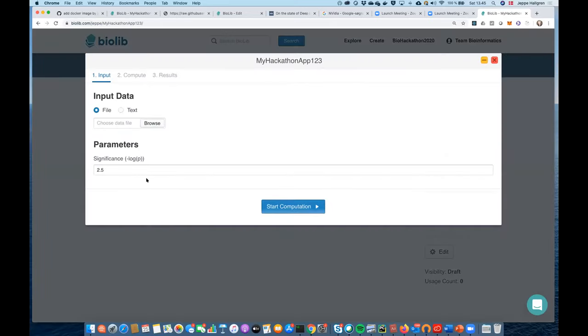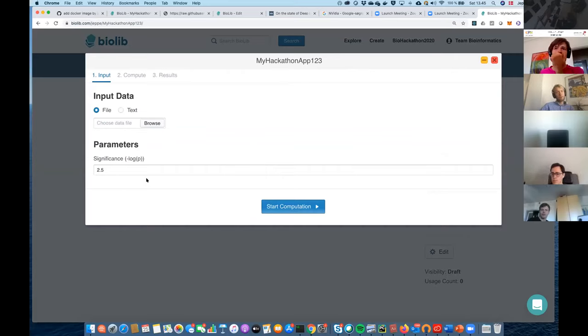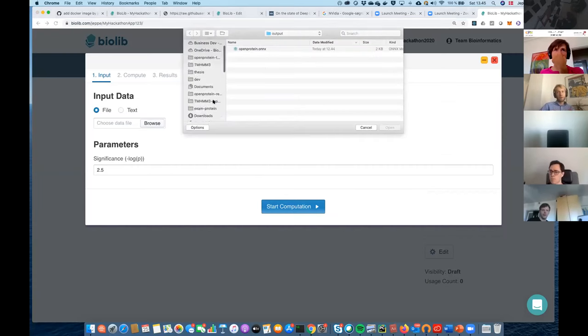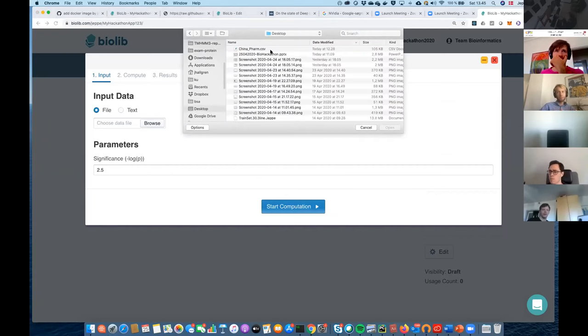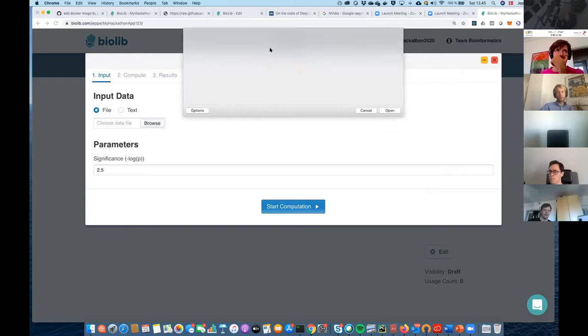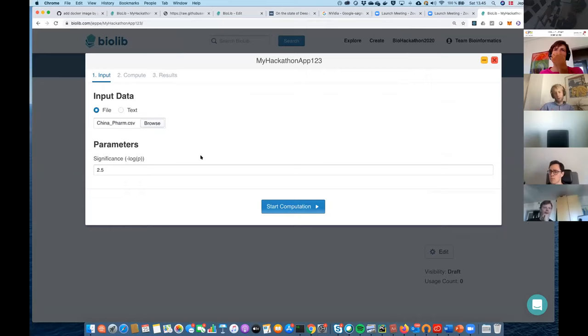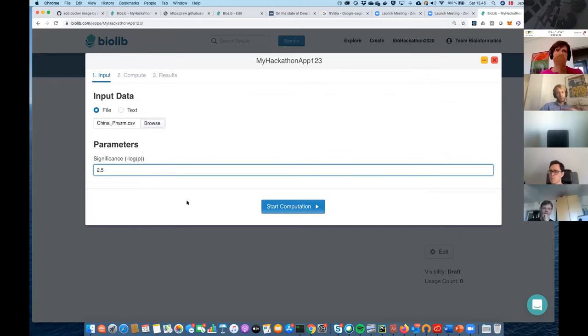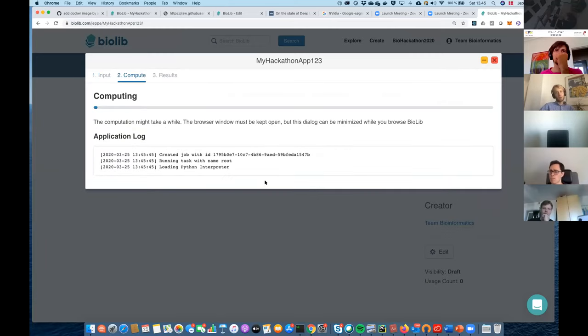So I'll just select this file. This is some gene expression data, as I said. I'll pick the CSV file. And again, this file is not actually uploaded anywhere. It's just in Google Chrome now inside the browser's memory. I'll just get prompted with some significant threshold. I could change that. I could just use the default value. And I'll press start computation.